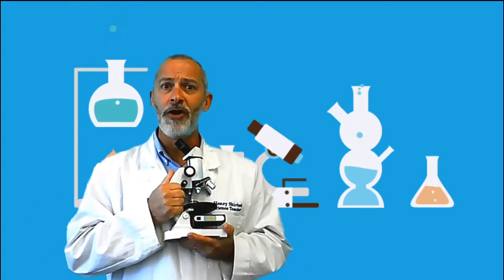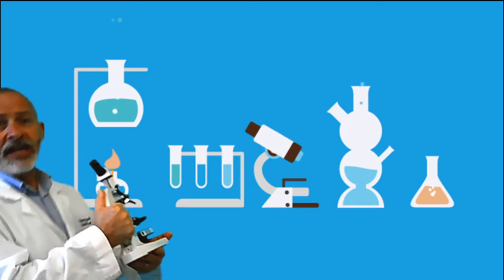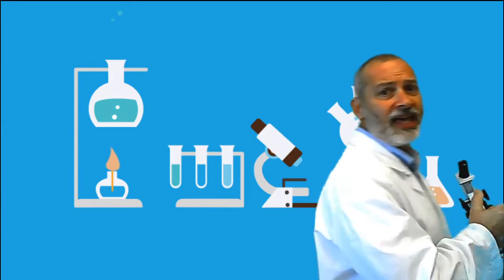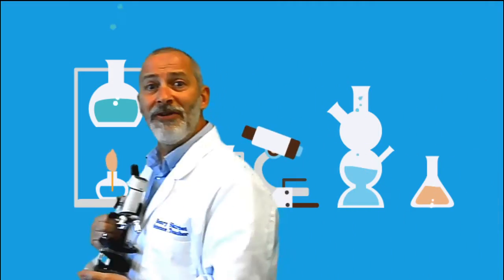I said the arm, the base, and carry it close. Once more, the arm, the base, and carry it close.